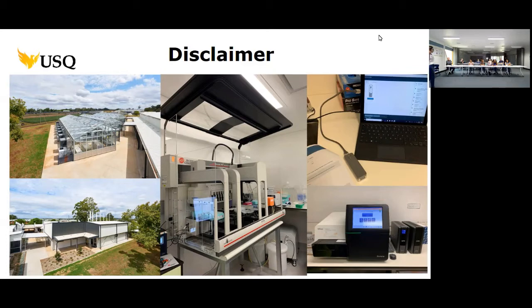My job is to manage the facilities, as most of you know, and that includes our beautiful facilities down here in the precinct. It also includes up in Dbook, where we've got our liquid handling robot, which has been a lot of fun lately. We've been doing some work on that. Also the Illumina MiSeq, which we've had for about 4 years now. And of course, up in the top corner there, our minION. These are the facilities that I manage. Not necessarily an expert in sequencing, but I'm happy to help. So that's my first disclaimer.